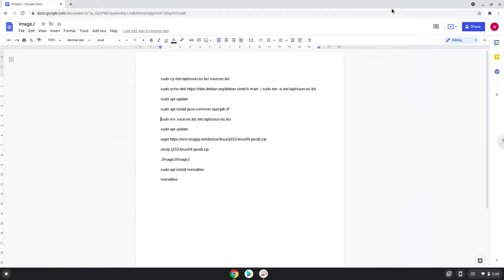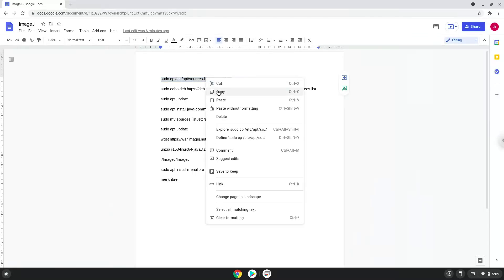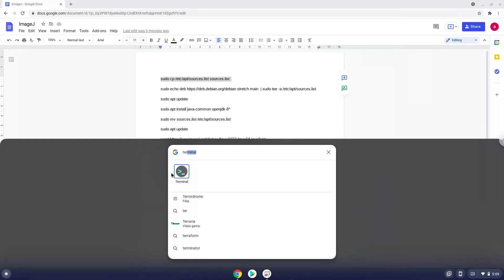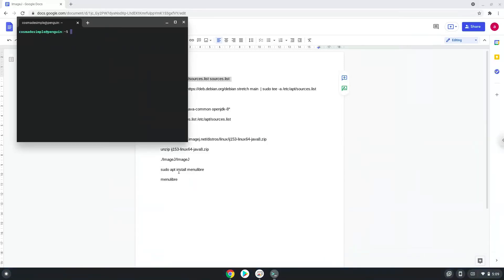Now we will copy the first command and open a terminal session from our app menu. Next, we will paste the command into our terminal, either with a two-finger click on your terminal or click Ctrl+Shift+V together. This command will make a copy of your Linux source file.